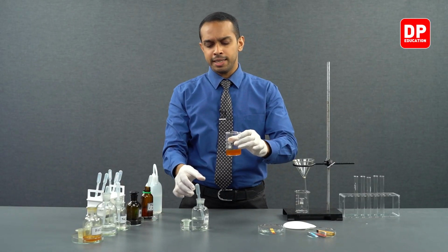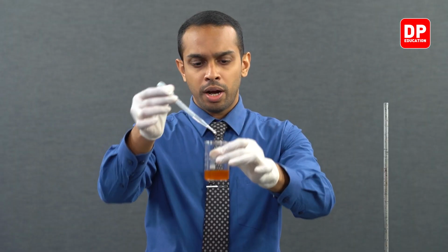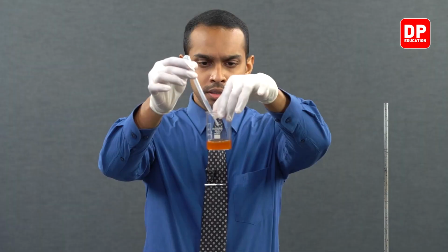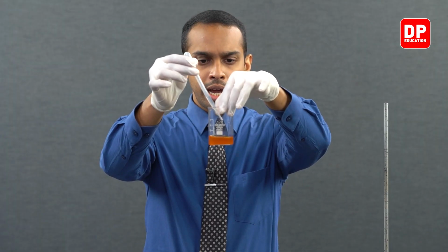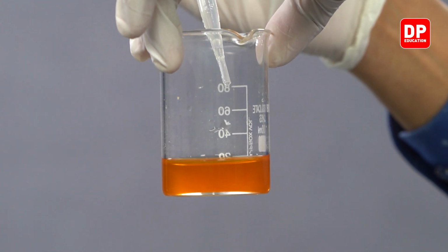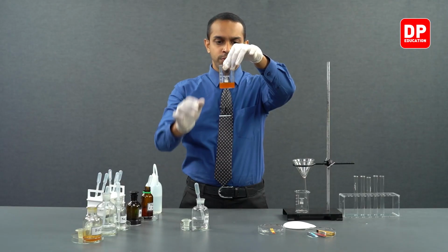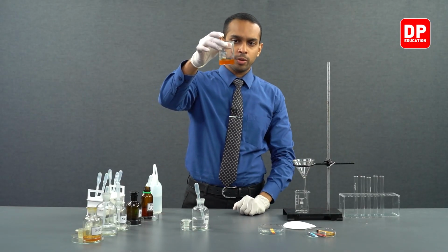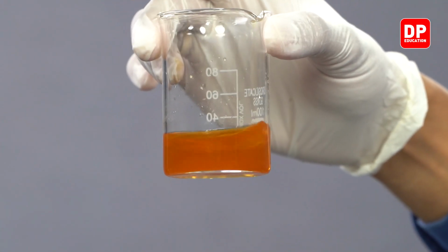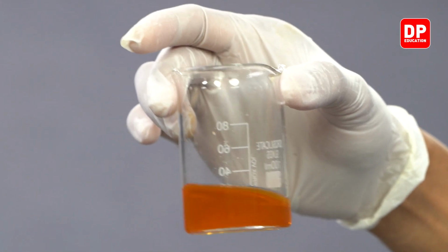So what happens here is, since the medium is acidic, when you are adding ammonium hydroxide, the hydroxide ions react with the H plus ions and remove the H plus ions from the aqueous medium. And thereby, we make the ferric chloride solution neutral.